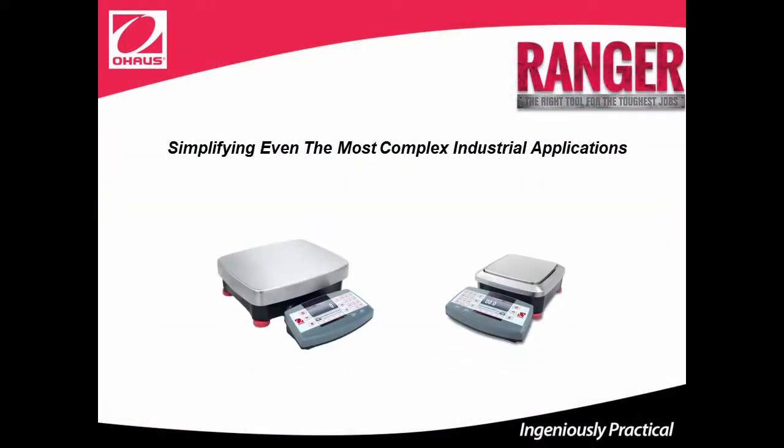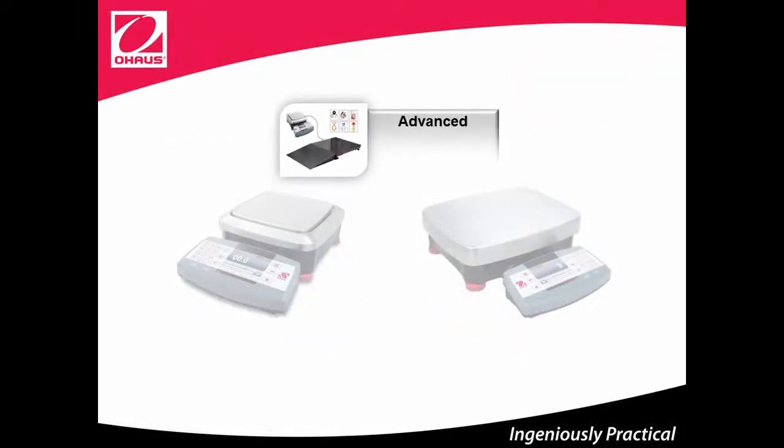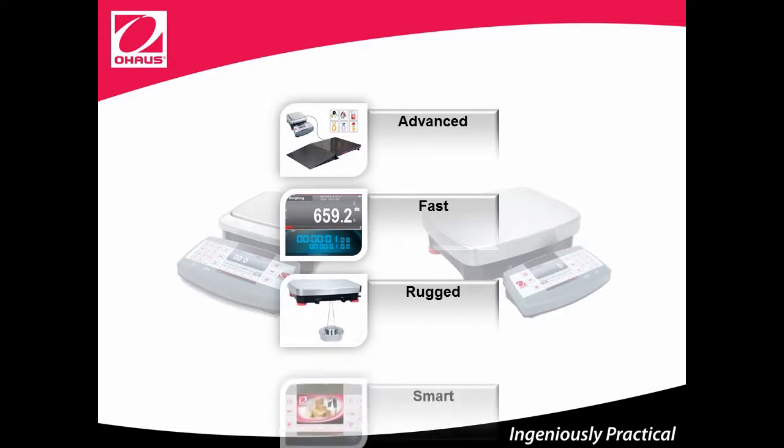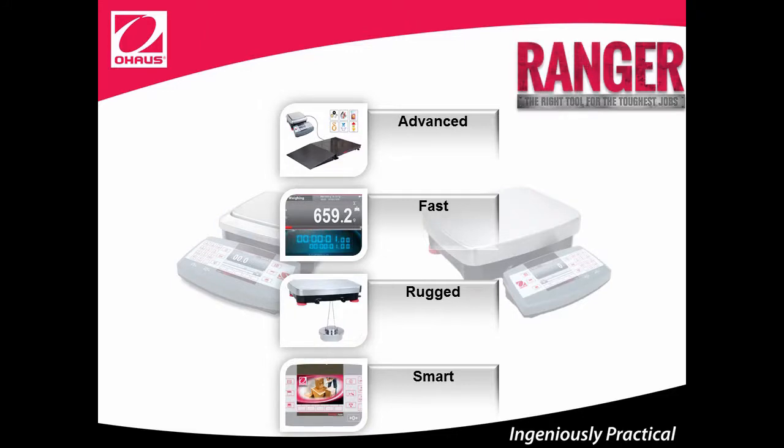Simplifying even the most complex industrial applications. For Ranger 7000, there's one resounding theme. It offers the best of every ingenious feature that makes Ohaus industrial products the right tool for your toughest weighing jobs. Ranger 7000 is advanced, fast, rugged, and smart. These are just a few of the reasons that make Ranger 7000 the right tool for the toughest jobs.